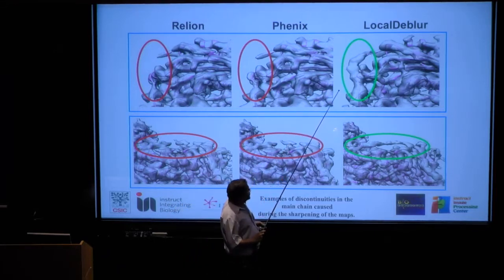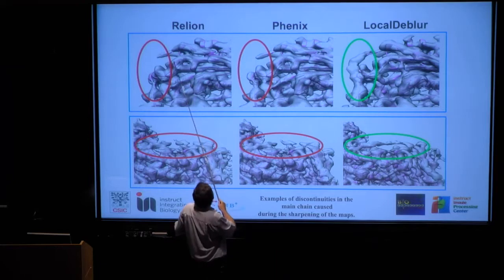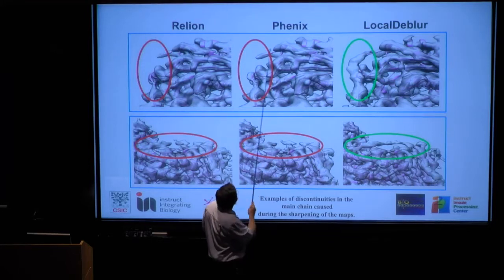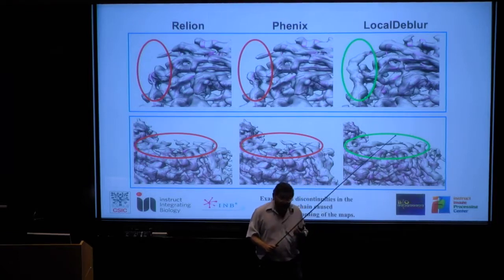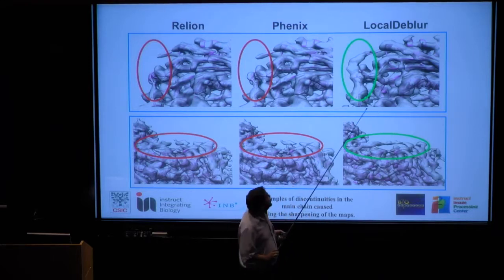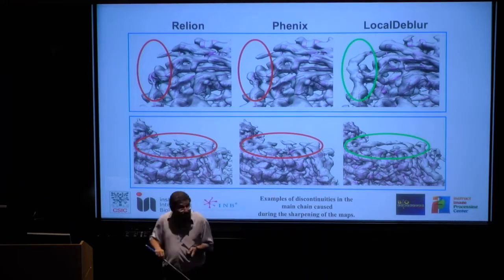This is in the proteasome structure, that really are not very well seen. They are very unstructured, very disconnected when we apply other methods, and really when we apply one that takes into account some prior of what has happened, that is actually an approximation to the blurring, well, this gets much better. This loop gets much better defined.